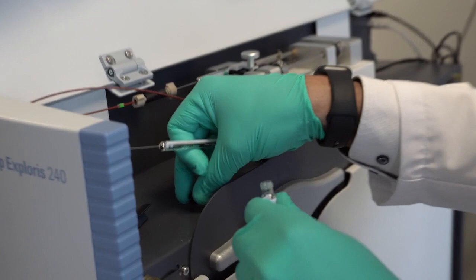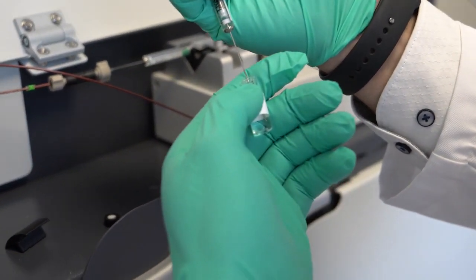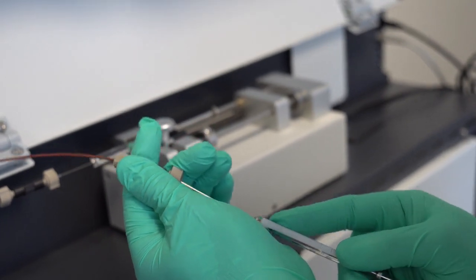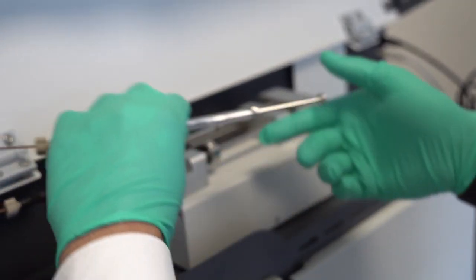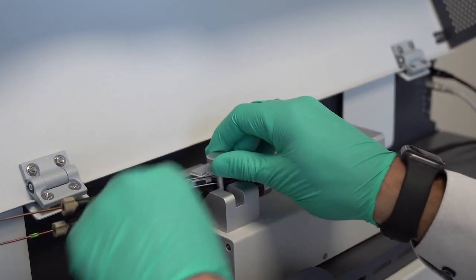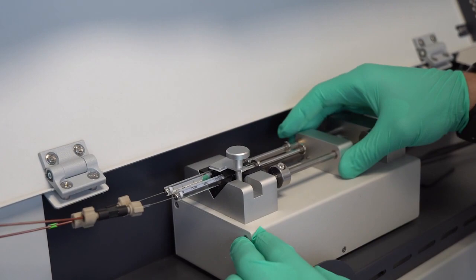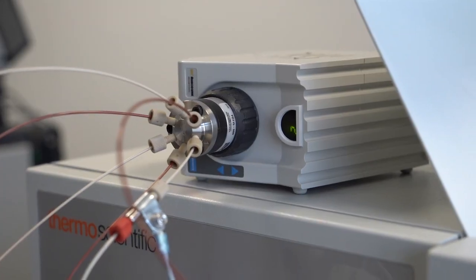To do so, we've been developing the dual syringe inlet system. The two syringes are filled with sample or reference solutions respectively and they are flushed out by the Explorers syringe pump. The dual syringe inlet system uses a diverter valve to switch between the reference and the sample solutions entering the mass spectrometer.